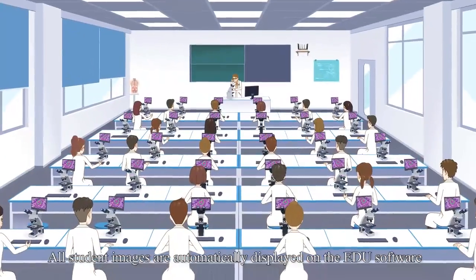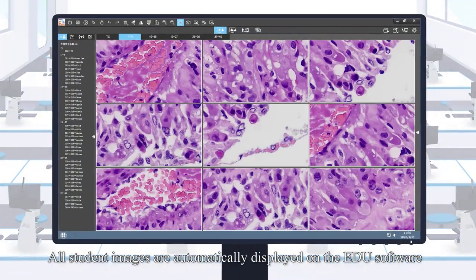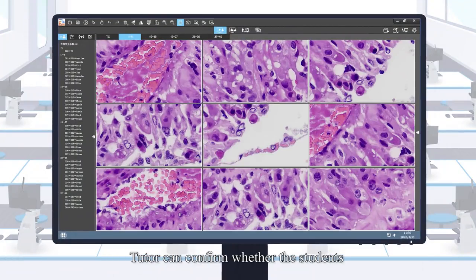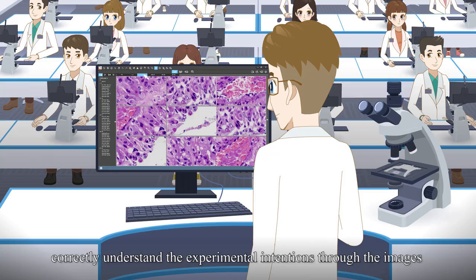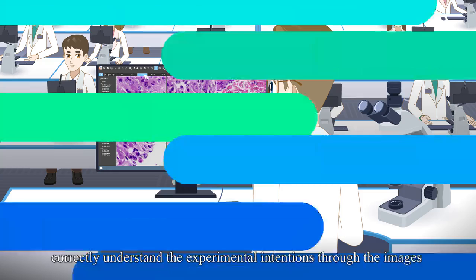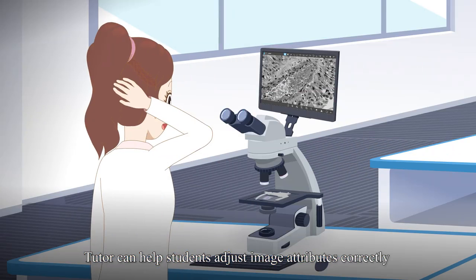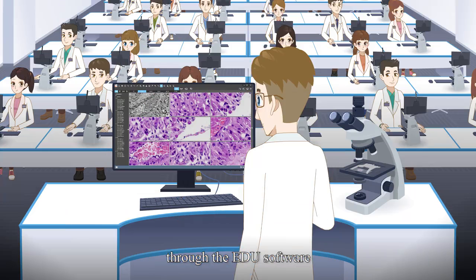All student images are automatically displayed on the EDU software. Tutor can confirm whether the students correctly understand the experimental intentions through the images. Tutor can help students adjust image attributes correctly through the EDU software.